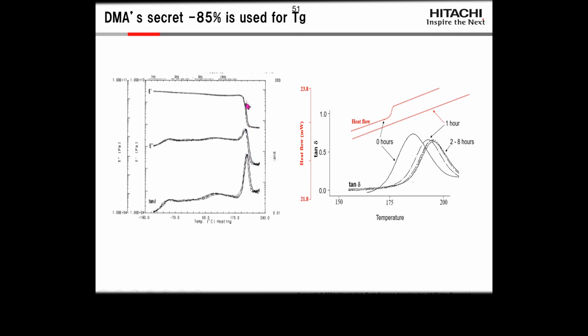If you notice, they don't line up exactly right. And that was one of the reasons why it's important to remember that the glass transition is a region of behavior. It is not a specific temperature.